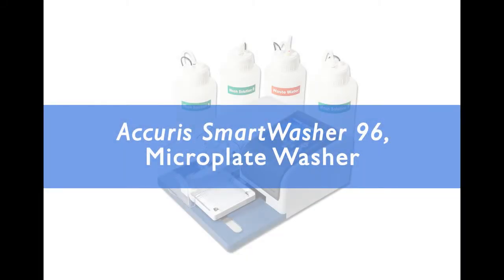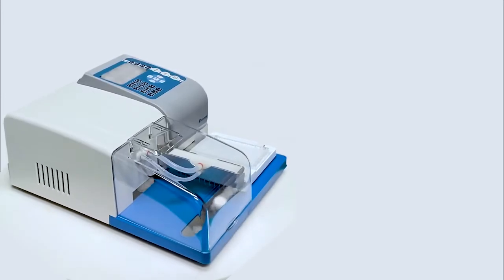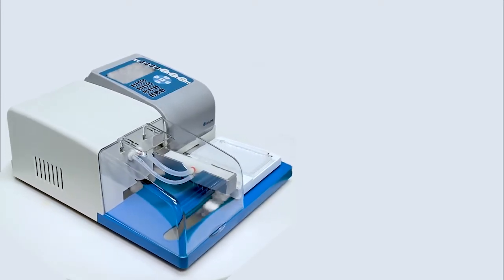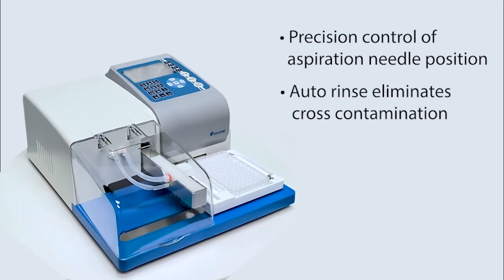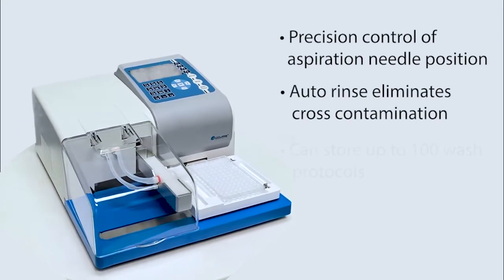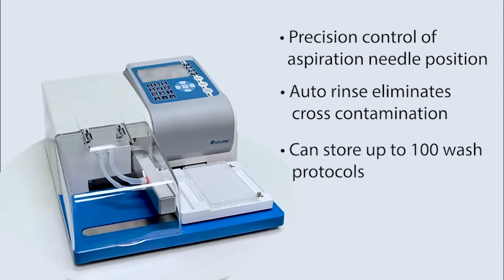Introducing the Accuris SmartWasher 96. The SmartWasher 96 is an automated microplate washing system that offers precision control of aspiration needle position, features an auto rinse function that eliminates cross-contamination, and allows editing and storing up to 100 wash protocols.